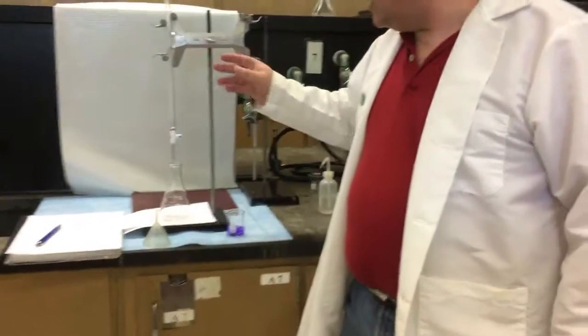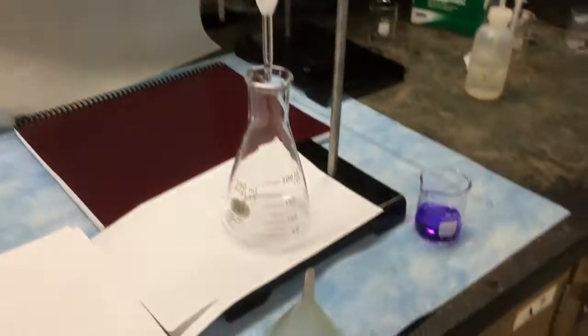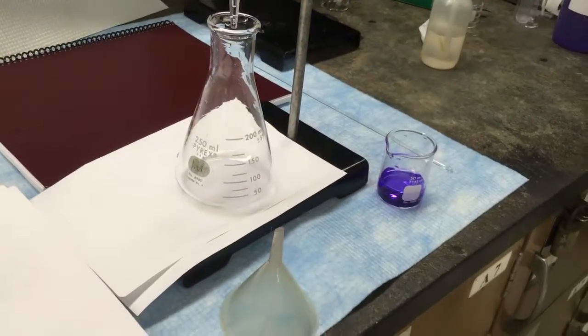You mount it on the stand so that the burette is sitting over the foot of the container. If you are working with a titration or you're looking for a color change, you usually want some white paper under it so you can see the color change more easily.